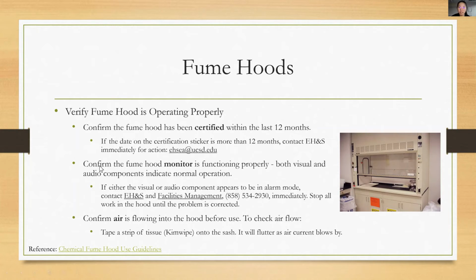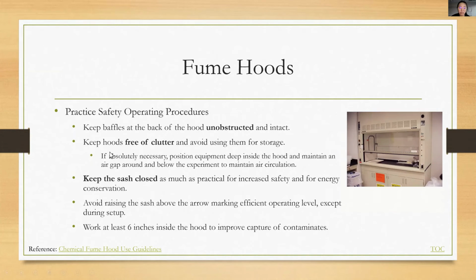But sometimes when the fume hood or biosafety cabinet is not working properly, for example, the monitor is not working, please definitely contact the EH&S department or the providers to get them fixed. Another important thing is to keep the fume hoods and biosafety cabinets free of clutter, and keep the sash closed when you are not using them.